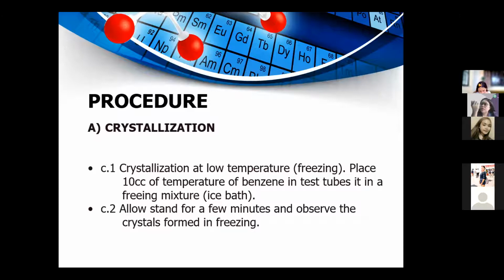Last procedure for crystallization is crystallization at low temperature or in freezing temperature. Place 10 cubic centimeters of benzene in a test tube in a freezing mixture or ice bath. Last is to allow it to stand for a few minutes and observe the crystals formed in freezing.